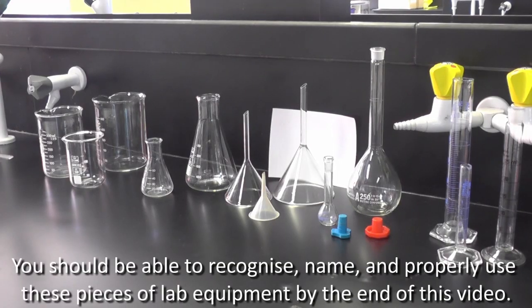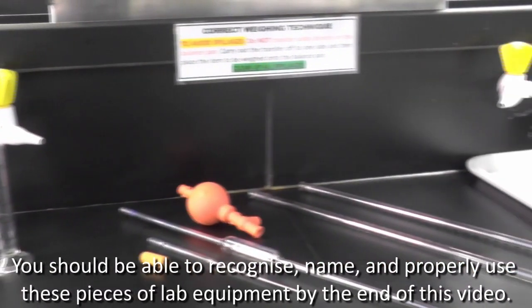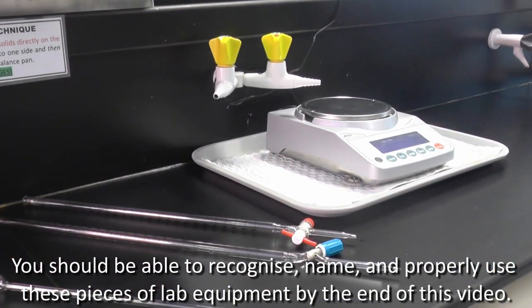Welcome to the laboratory. Today I'm going to introduce you to some of the glassware and equipment you'll be working with, show you how to use it safely, effectively, and maybe save you some time in the lab. It's important to use the right equipment for the right task, specifically when you're concerned about the accuracy of your experiment.